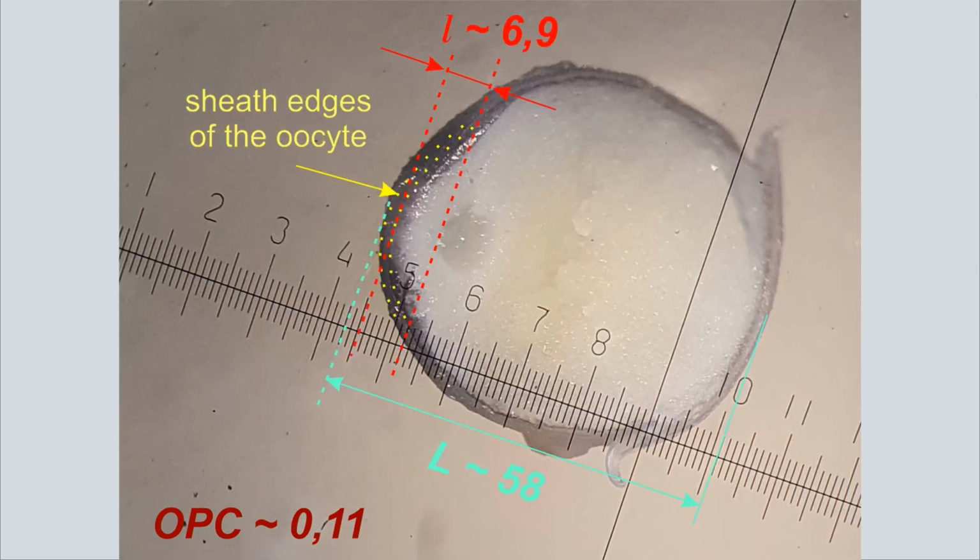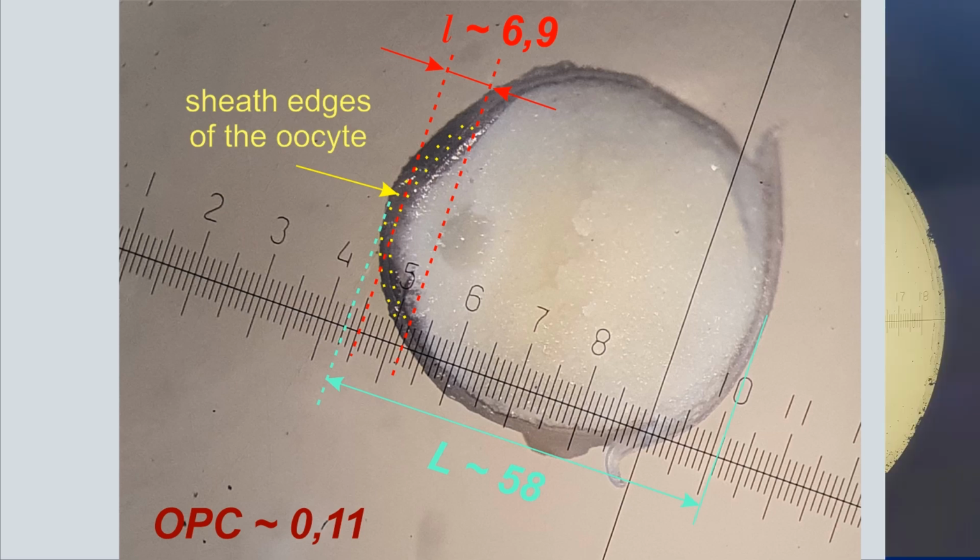In this slide we see an egg from a female already almost ready to spawn. It is clearly visible that the germinal vesicle has already completely moved into the area of the fine-grained yolk. At the same time, such fish, of course, still need a little pre-spawning holding.